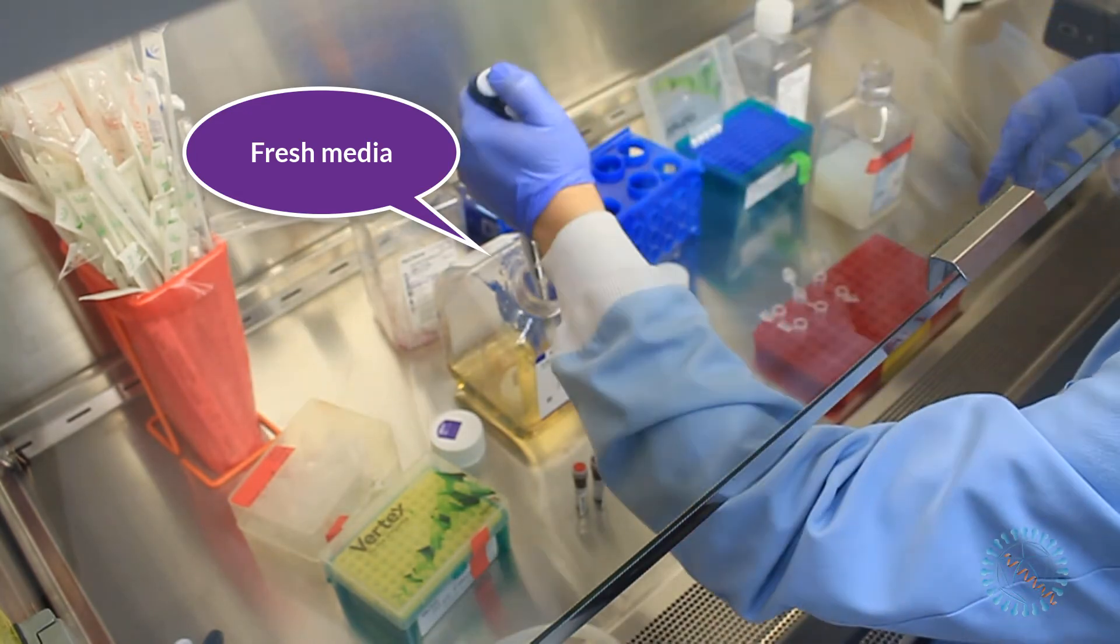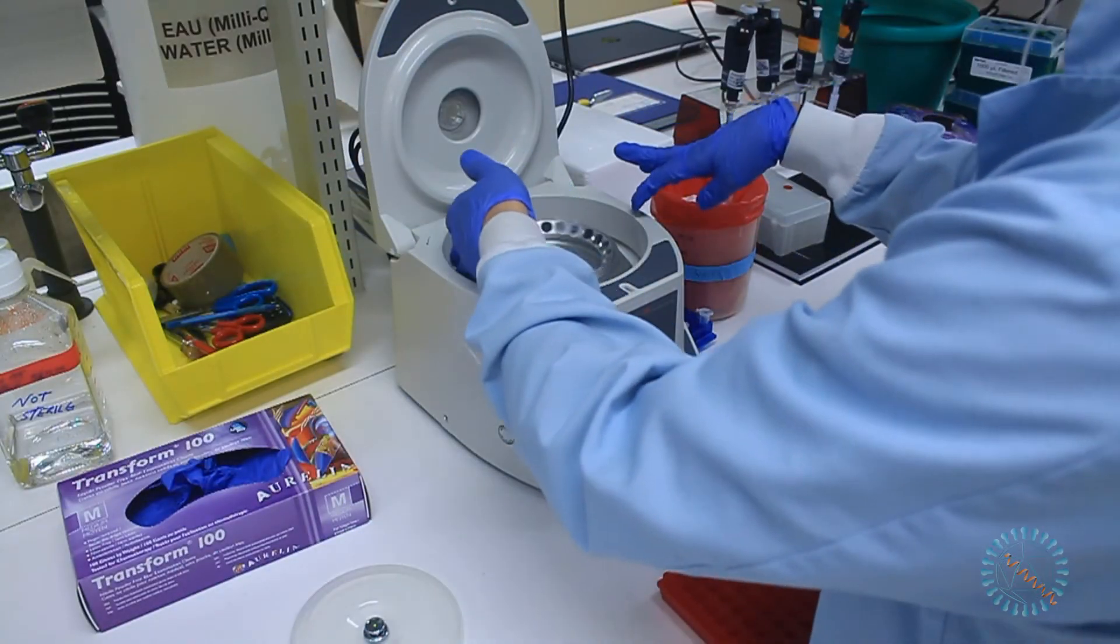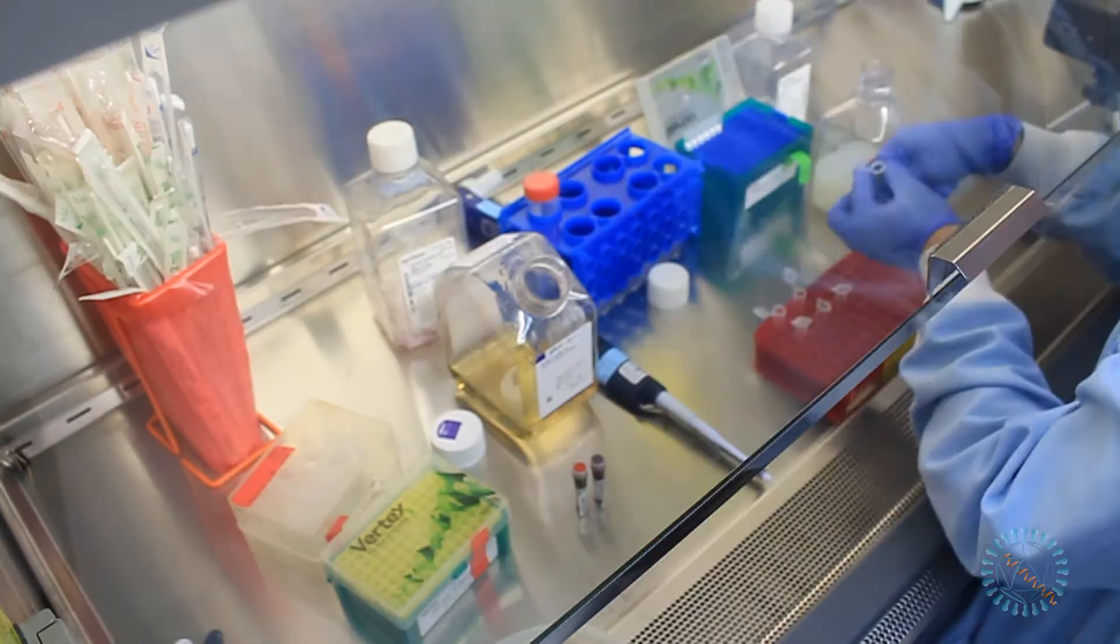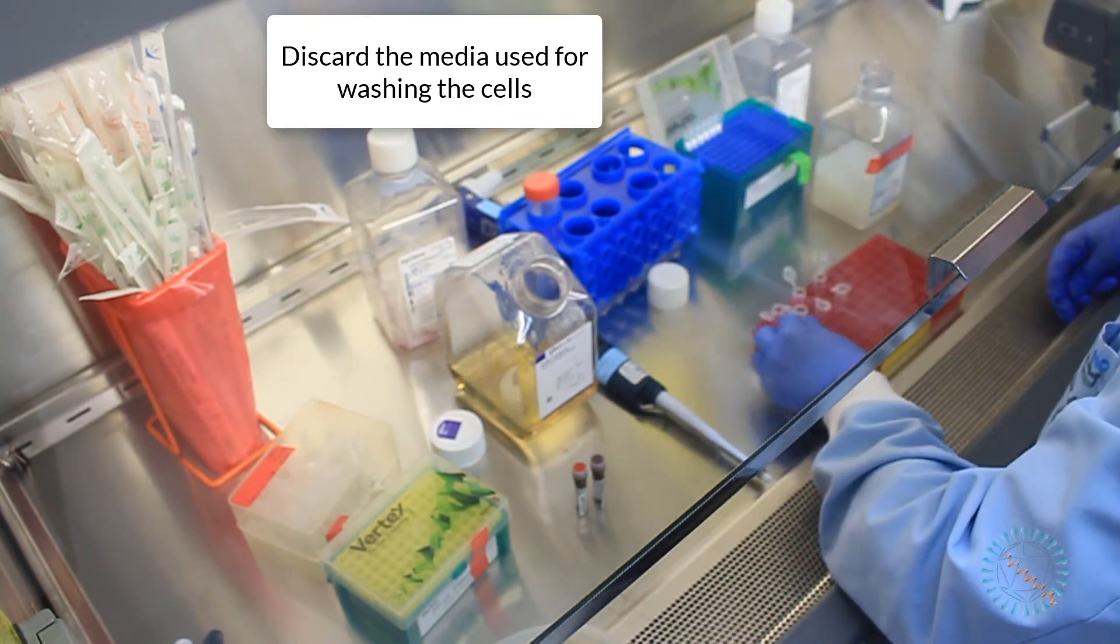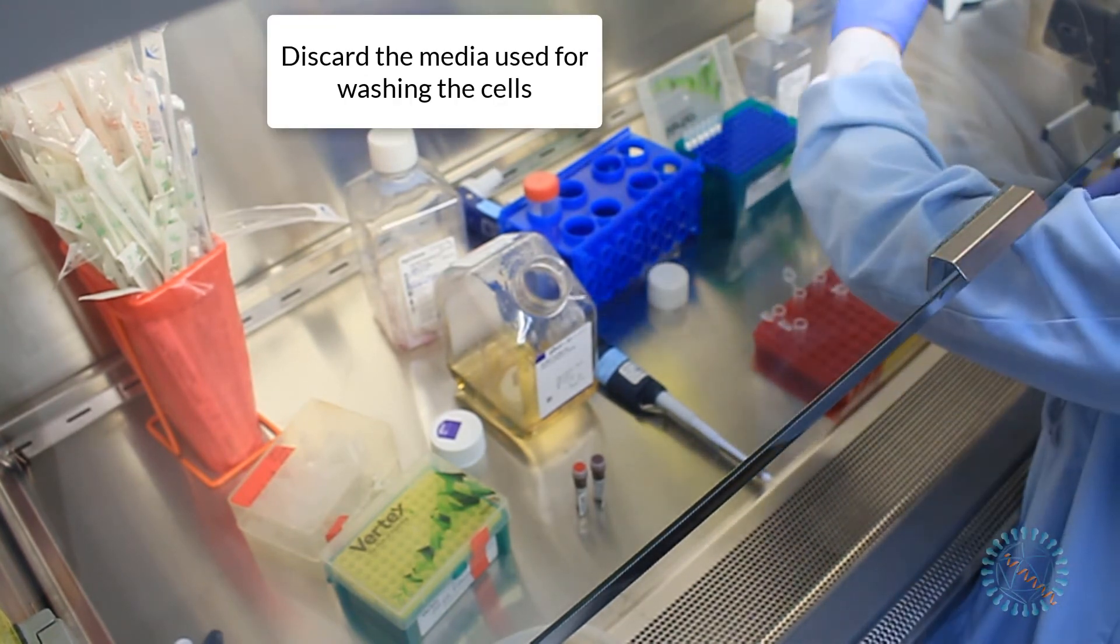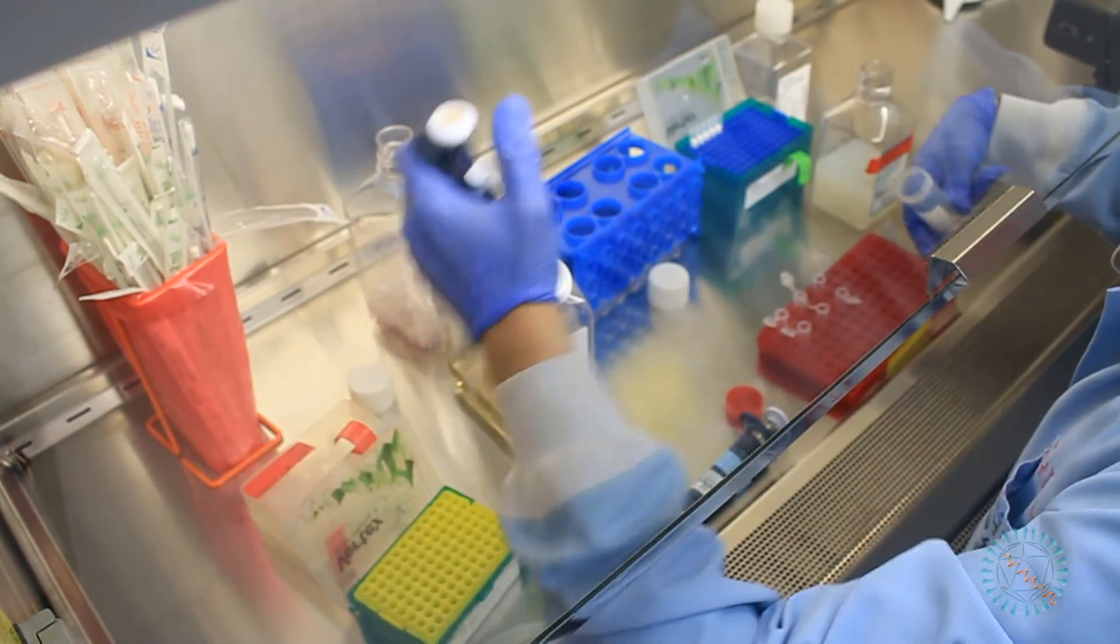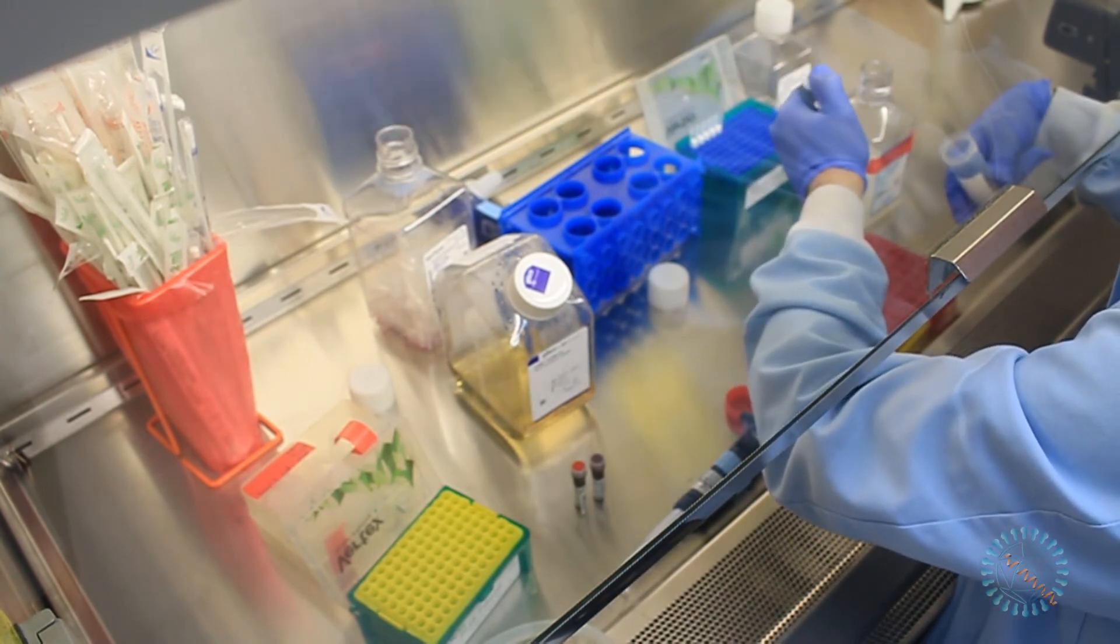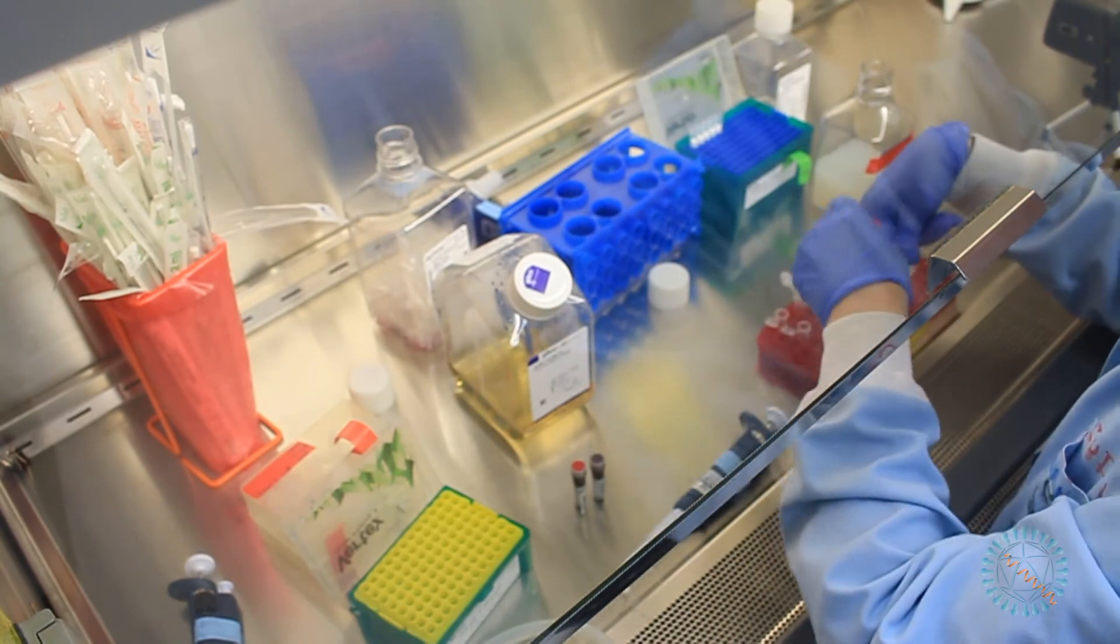Afterwards, we go back to the centrifuge to pellet down the cells for a second time, so that we can complete the wash by removing the freshly added media. After discarding the fresh media, we can now proceed to resuspend the cells in a solution with the toxic substance or in phosphate buffer. For this experiment, cells were incubated for 15 minutes and then moved into the flow cytometer room for the last preparation step.